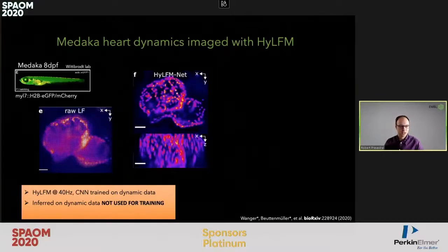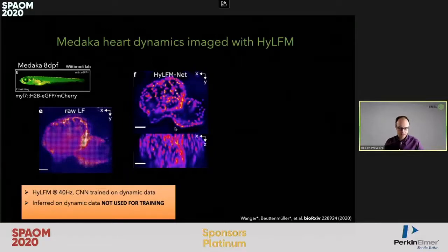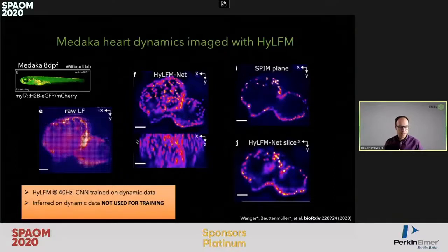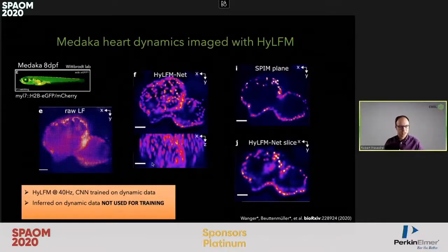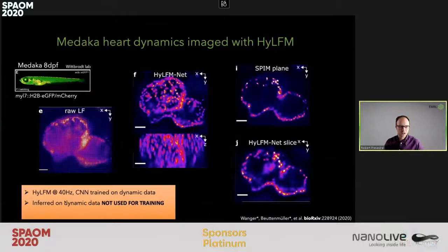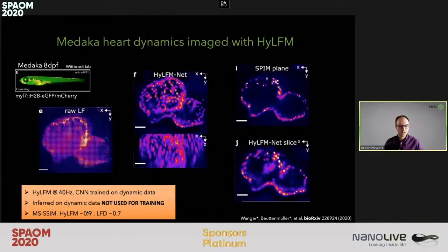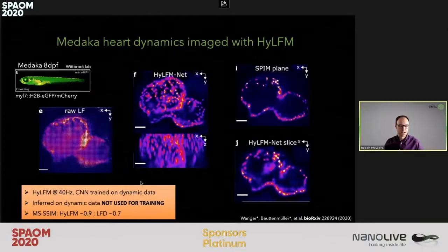We took the Medaka heart and here you can see the reconstruction of the neural network of a beating Medaka heart, with individual planes compared to the high-resolution SPIM data. These reconstructions are done on samples not included in training, which actually shows the high generalization of our networks. We can compute image metrics showing that with High LFM Net we actually get higher values than with standard deconvolution.